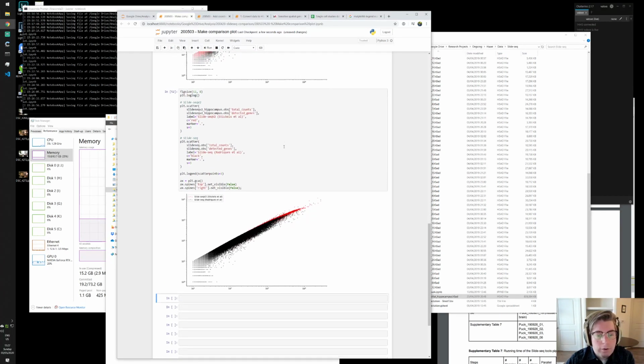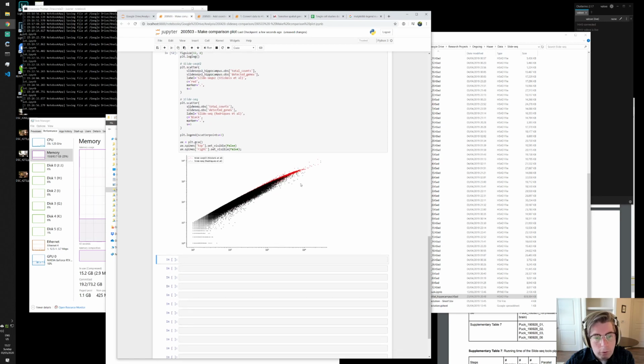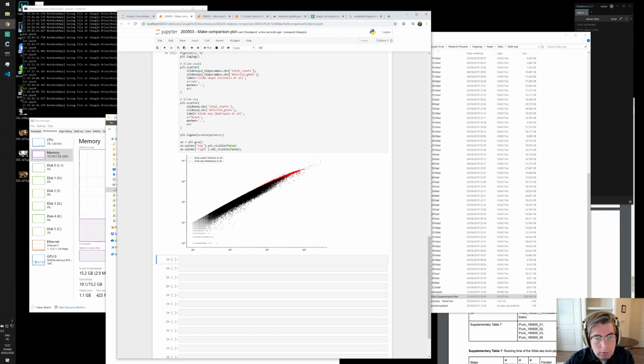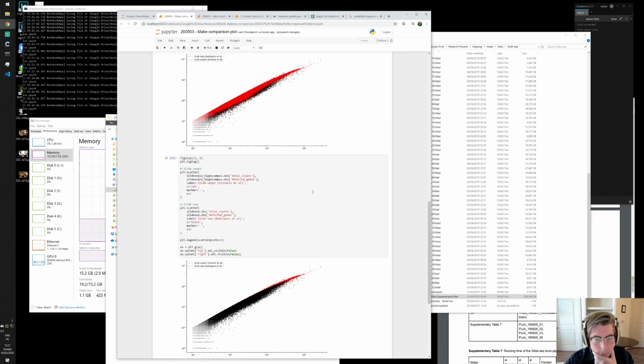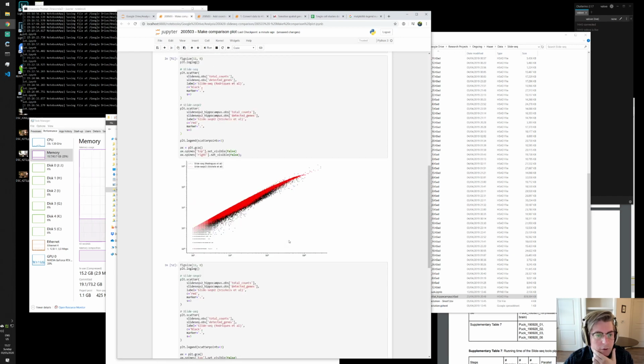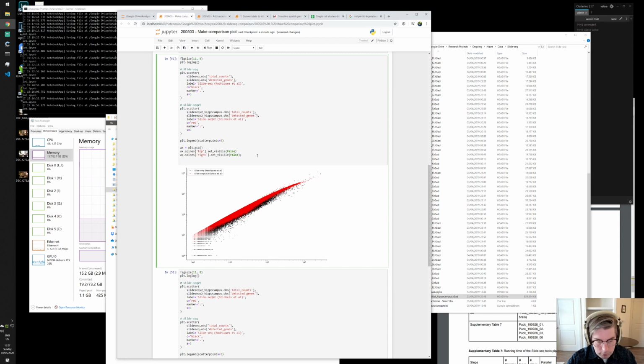Yeah, okay. From this you could argue that there is a slight increase, but it's very slight. And it's for a very small population of cells. Actually what I really should do, just to avoid confusion, is add labels to the axis, which is easy to forget when you make the same plot every day.